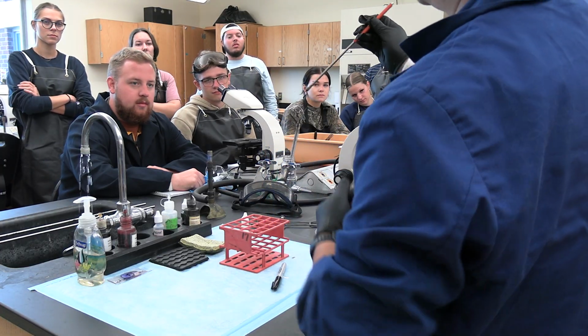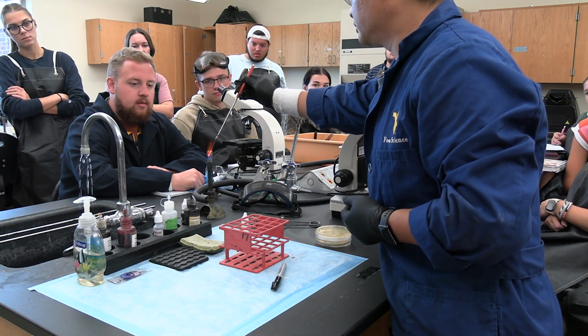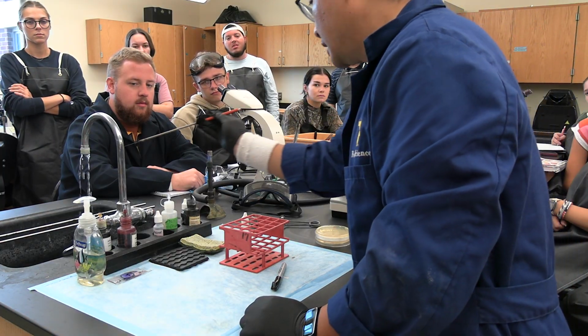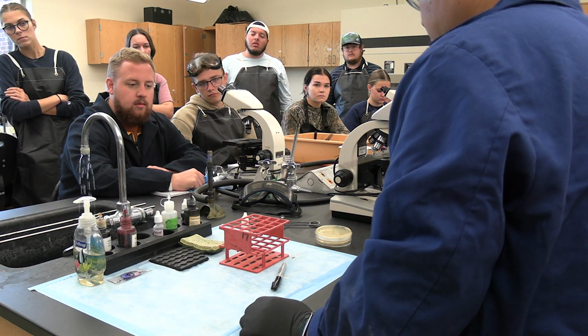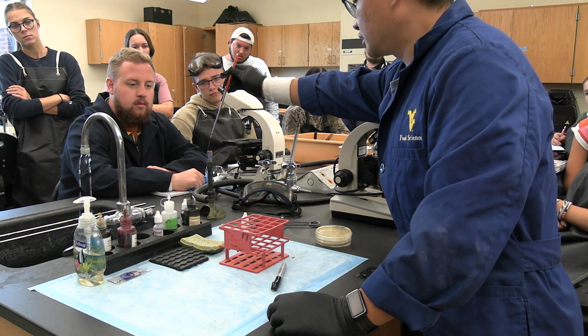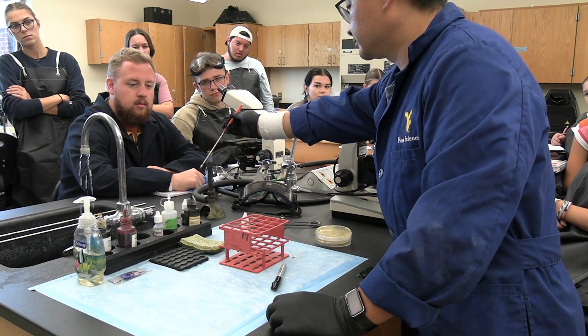First, flame the loop at a 45-degree angle, sterilize everything. Then add a little bit of water. So 1 drop, another drop, that's enough. Then we're going to sterilize it again, because we're going to touch bacteria.